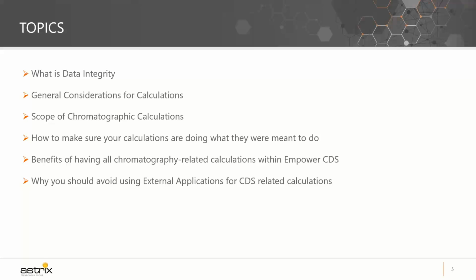Benefits of having all chromatography-related calculations in Empower, and why you should avoid using external applications for CDS-related calculations. We will talk about why CDS itself is often the best location for these calculations, and what are the things you need to pay attention to in case you need to do them externally. So next slide, please.